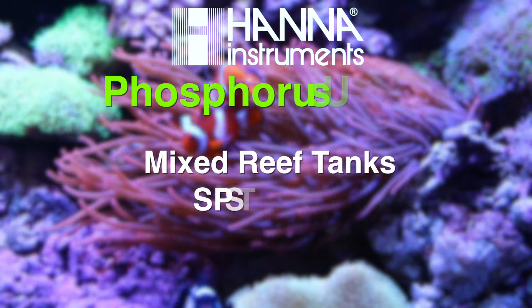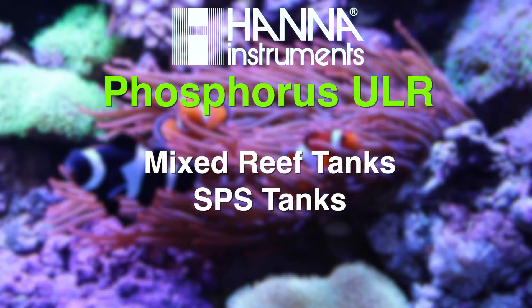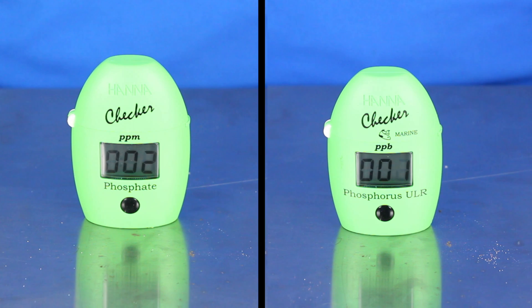The second checker is the ultra-low range phosphorus checker, which is ideal for a majority of reef hobbyists that require precise phosphate control. This ULR phosphorus checker measures levels between 0 and 200 parts per billion, has a resolution of 1 part per billion, and an accuracy of plus or minus 5 parts per billion. This means you can more precisely measure phosphate within a low range that may not be detectable with other phosphate test kits on the market.